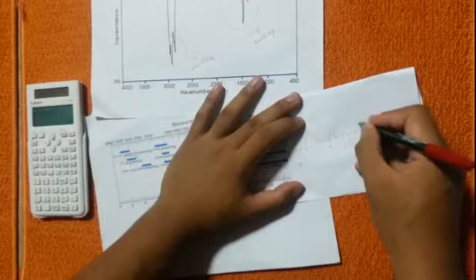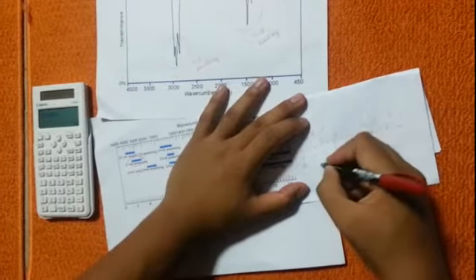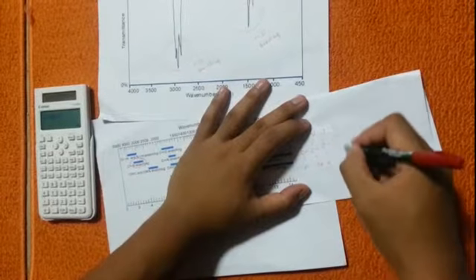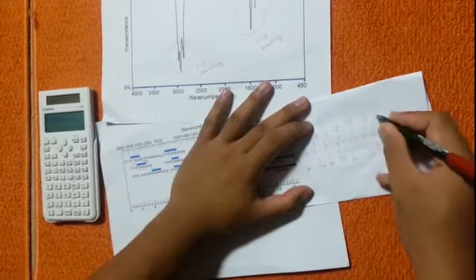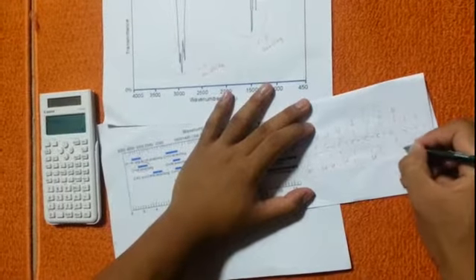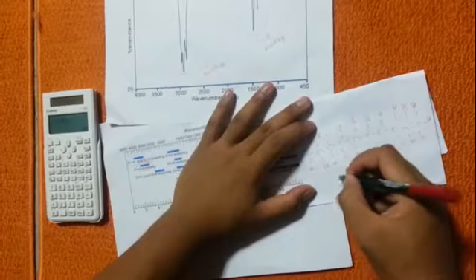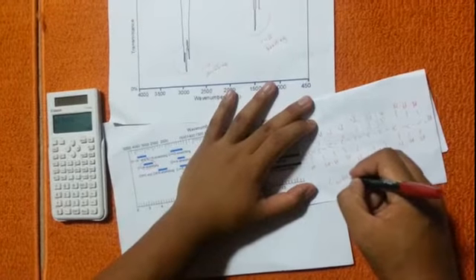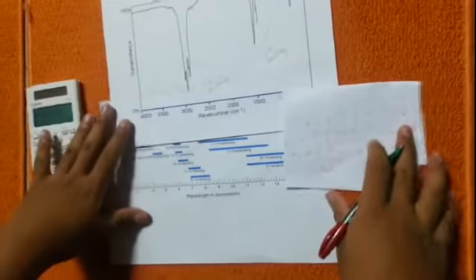So the number of H basically matches with the molecular formula. So it proves that C10H22 is the molecular formula for this graph. That's all, thank you.